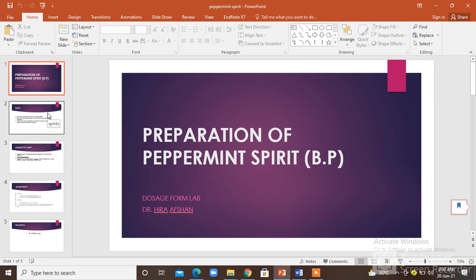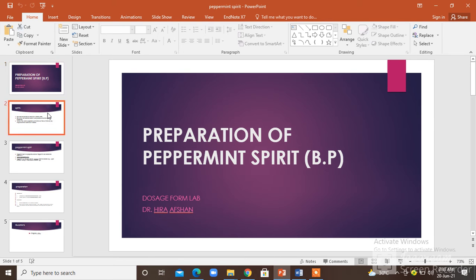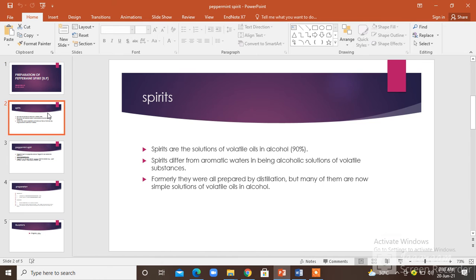Now we have another demonstration of dosage from lab - the preparation of peppermint spirit according to the British Pharmacopoeia. Spirits are solutions of volatile oils in 90% alcohol.